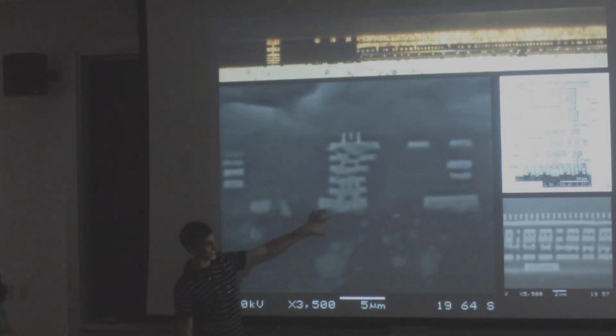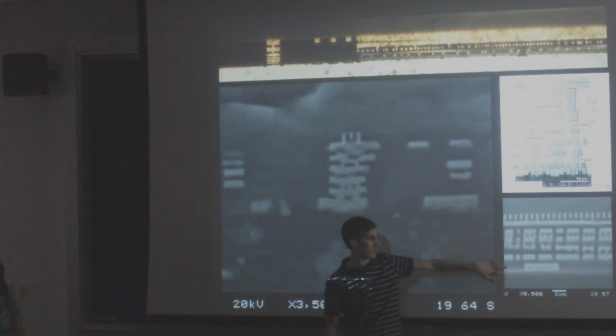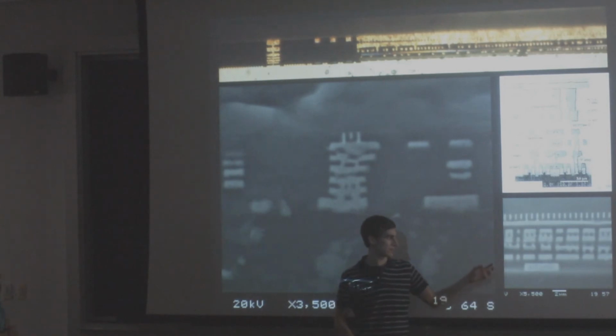And then this is a structure from the AMD chip, which you can't tell from this picture, but the silicon was cracked a little, so these are kind of bent. And then again, some more interesting features, and this is all metal in the AMD chip. So again, this is just an interesting example of how much metal there is in these chips and how complex the designs of each of these components are.